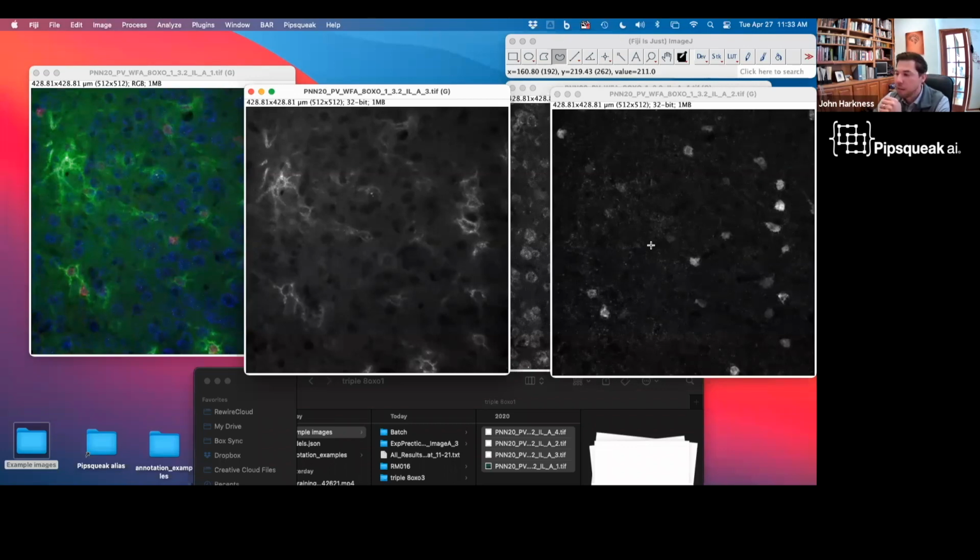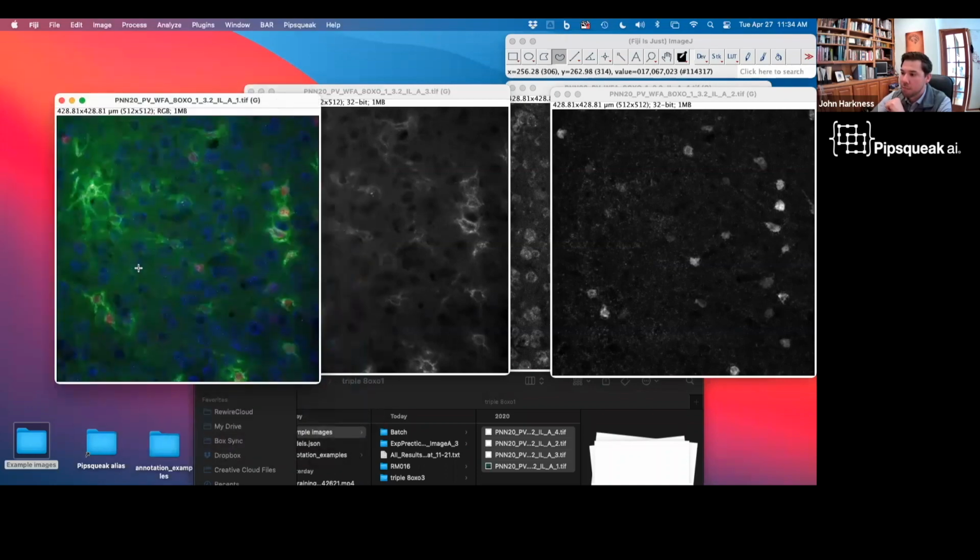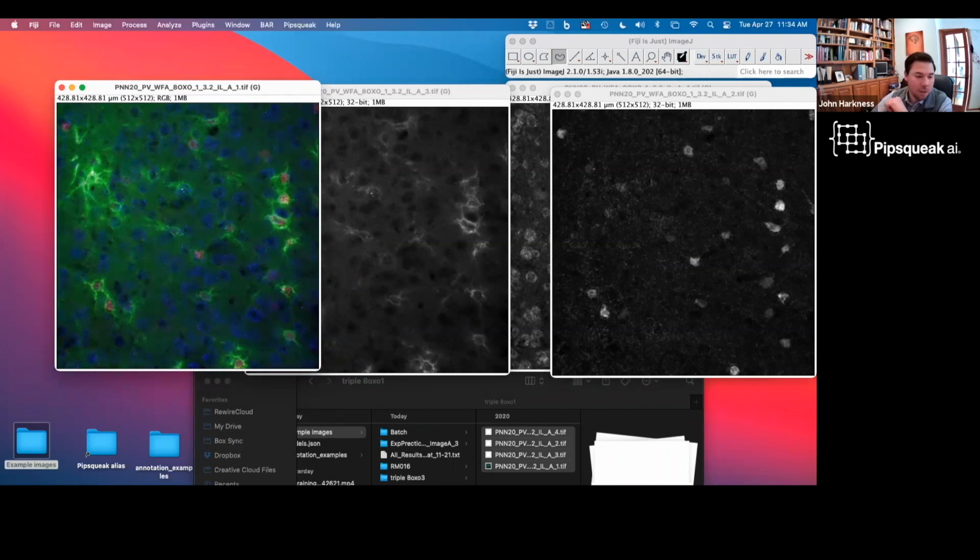these channels independently. One of the other things that I think is pretty exciting about that is we can start to take a merged channel like this, maybe analyze the WFA and the PARV at the same time, and get all those results all at once. So yeah, let me know if that answers your question, or if I misunderstood it.